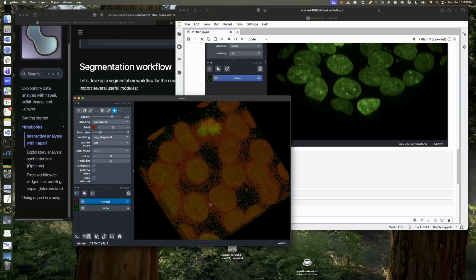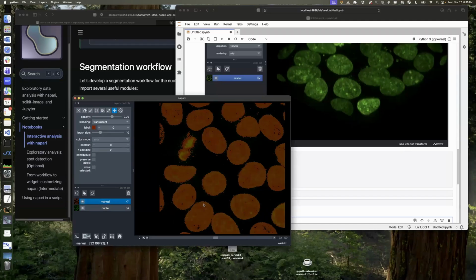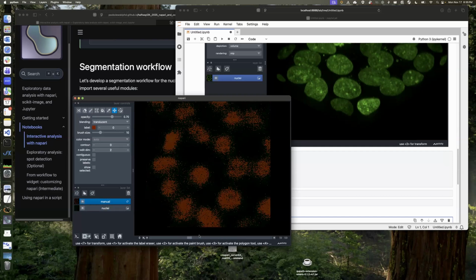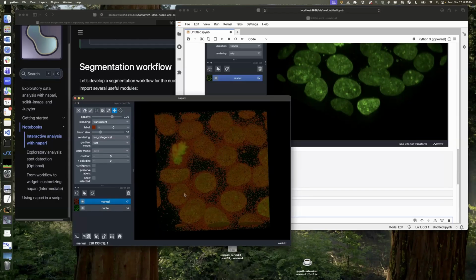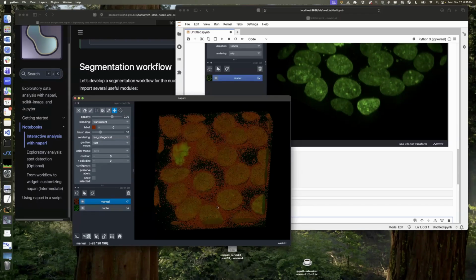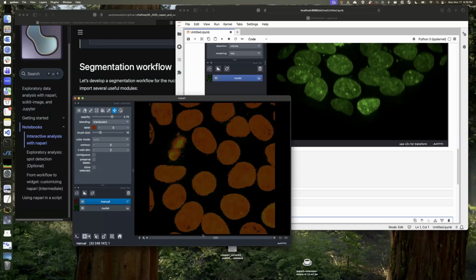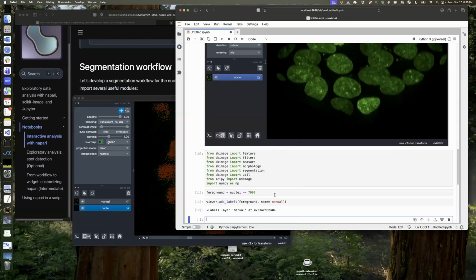And you could see that, okay, if we take a look, we can play around with this and we can see that, you know what, that's actually not that bad, but it's a little noisy, right? So it doesn't look great. And particularly when we see in 3D, we see that there is quite a lot of noise. So this manual approach, we could tune this, right? We could now use the information that we have here. We could say, well, let's take a look at some of this noise that's here. Let's see what the values are. I'm sorry, the values here are 8,000.